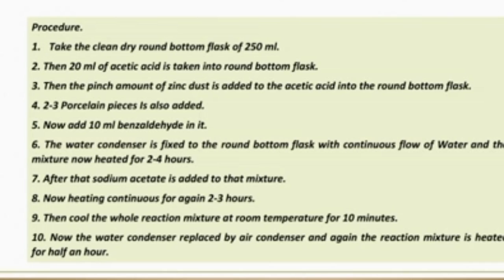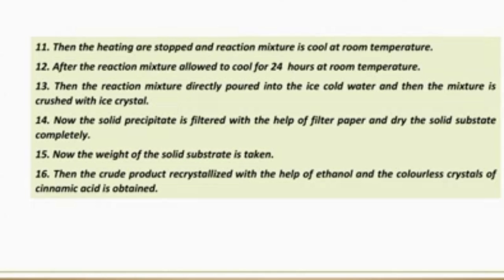Step 10 — the water condenser is replaced by an air condenser and the reaction mixture is heated again for half an hour. Step 11 — then the heating is stopped and the reaction mixture is cooled at room temperature.